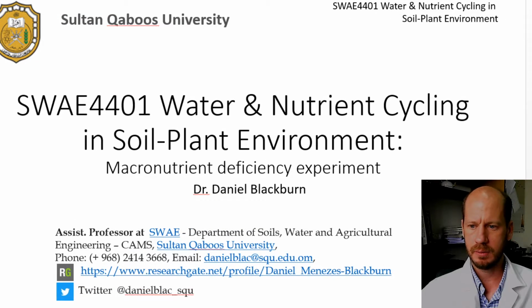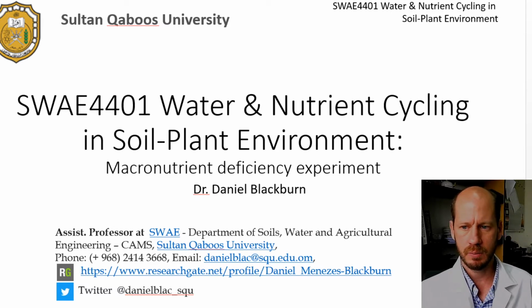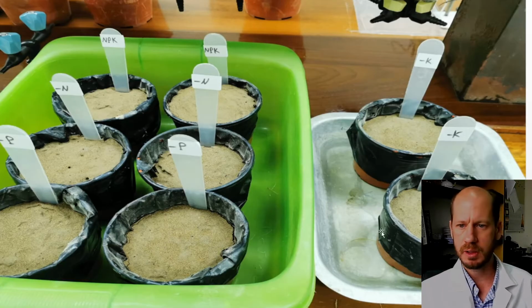All right, so this is the second video about the macronutrient deficient experiment, and I will give a quick revision about this experiment, but you should watch the previous video for more details. We're gonna go straight for the analysis of these nutrient deficiencies on the plant tissue. So this is how the experiment was set up.